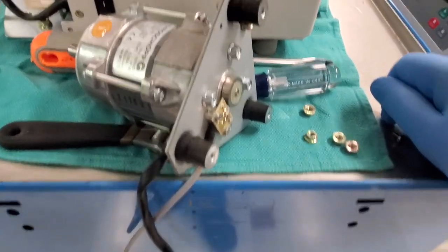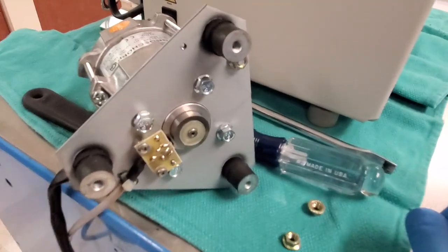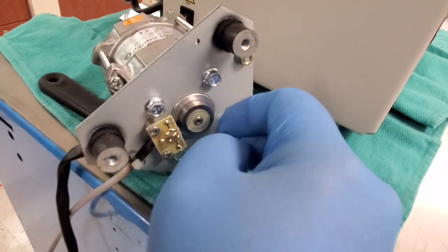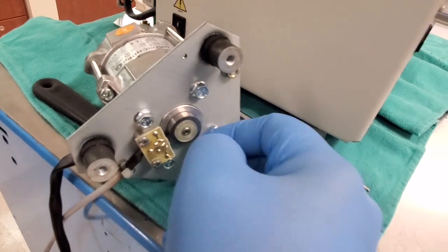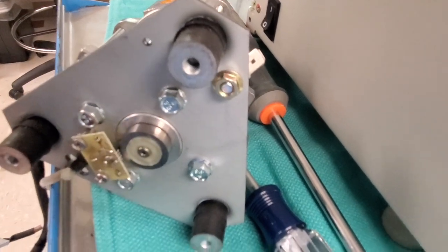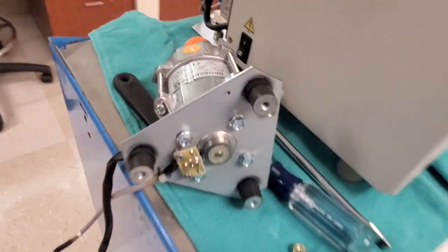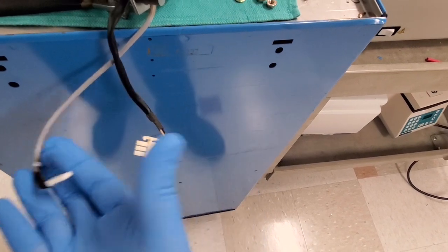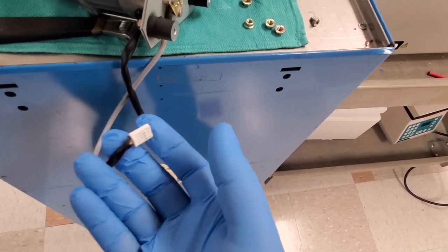I wanted to pull this motor out so you can get a better look at how it knows its speed. You can see that this one also has a round four-pole magnet attached to the rotor shaft, and then down here is your hall effect sensor. So on centrifuge motors, you always have your power and then you also have your tachometer.